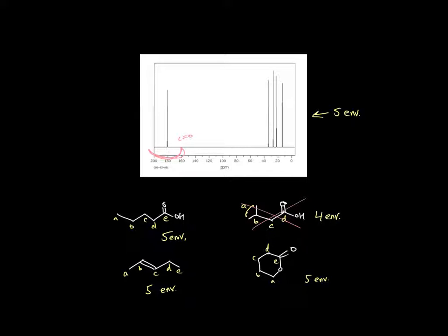So we can see that, let's go down here to the bottom. This alkene right here, it has no carbonyls. It has two guys that are in the C double bond C region. So you should see in this molecule for this NMR that we would have two carbons that are between approximately 100 and 150, and we have none. So this is definitely not a match.